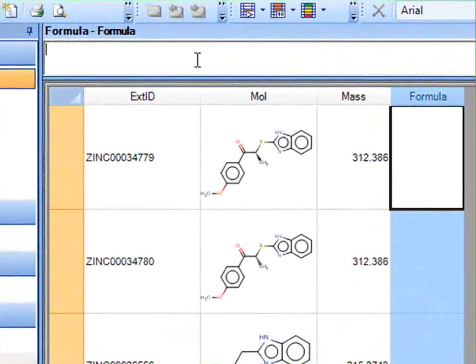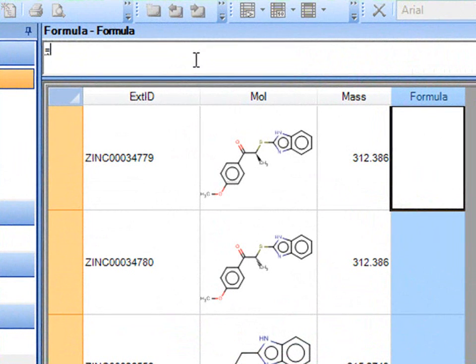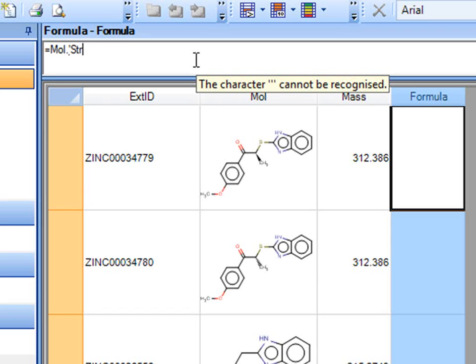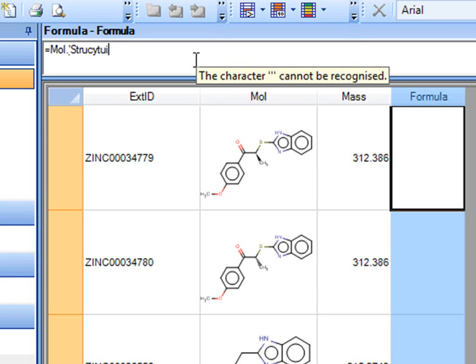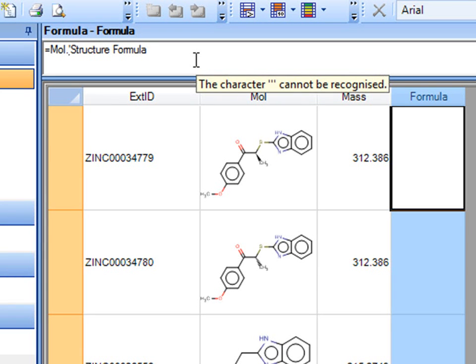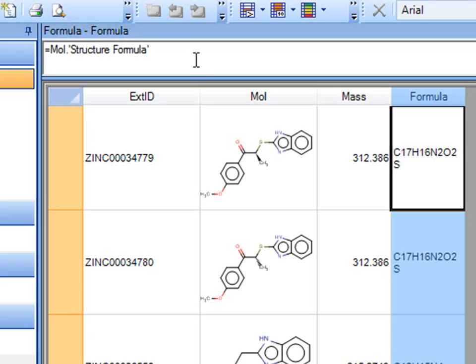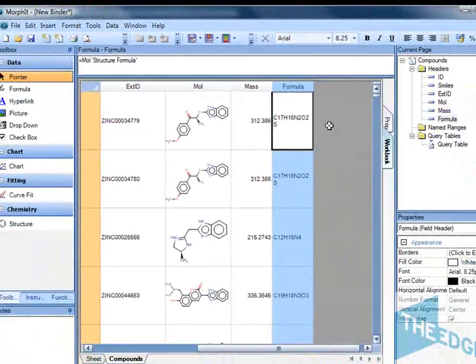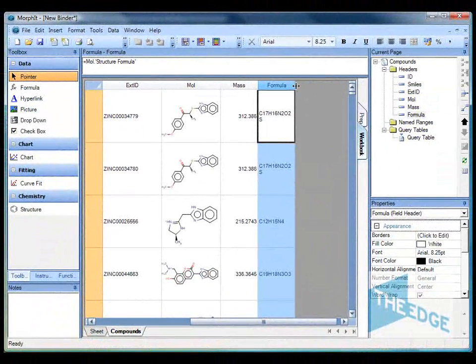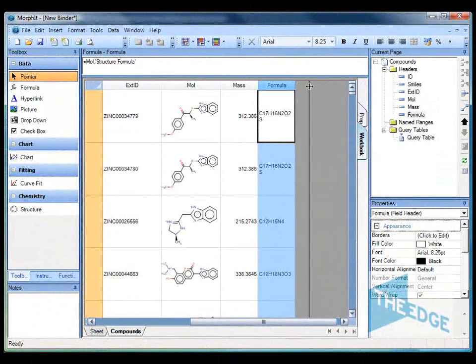In the second one we also reference the mole column and then it's called the structure formula. And that calculates the formula for all of those structures.